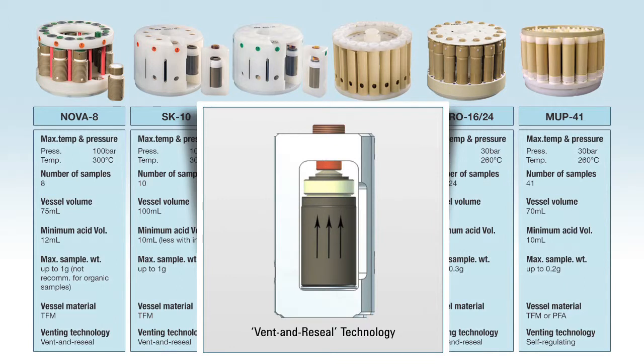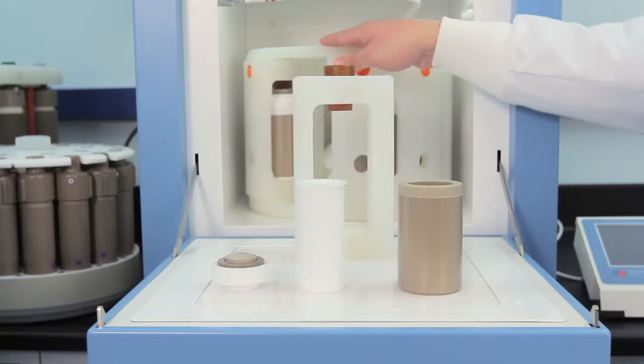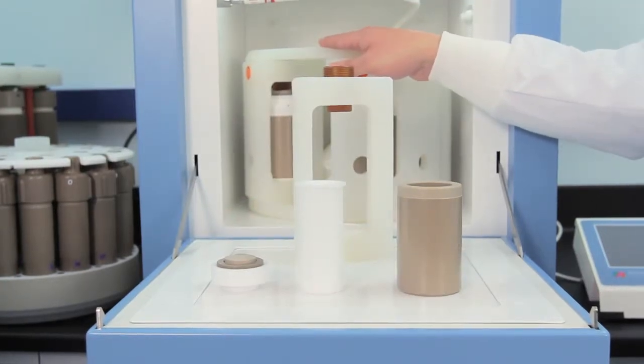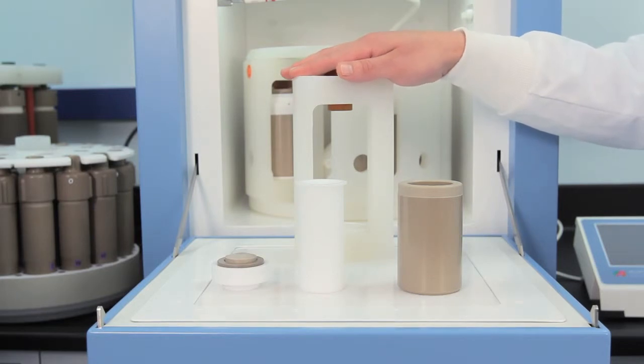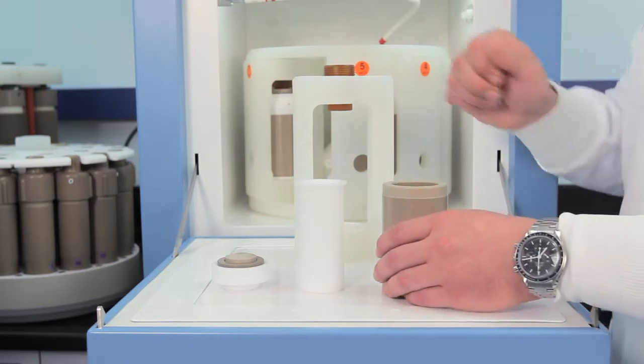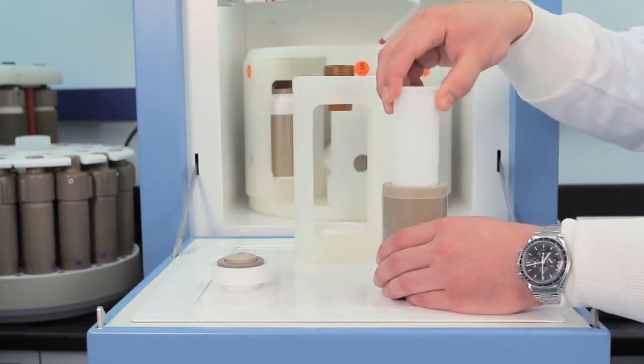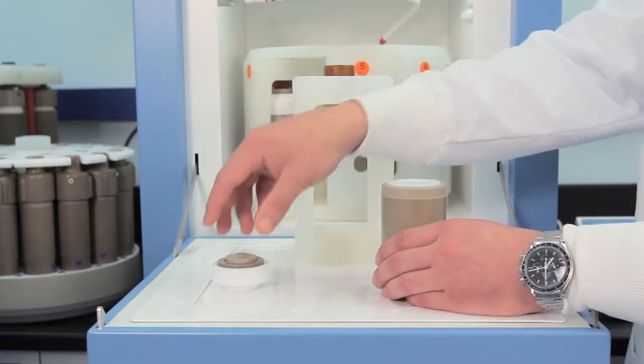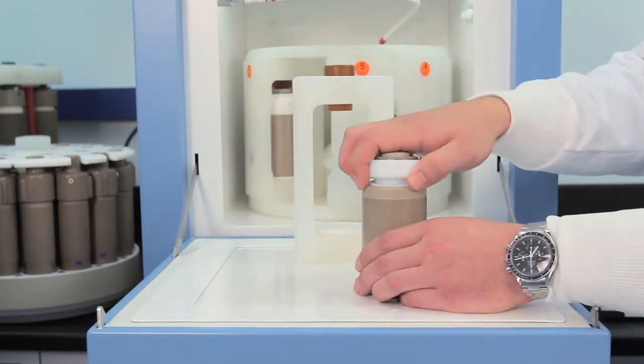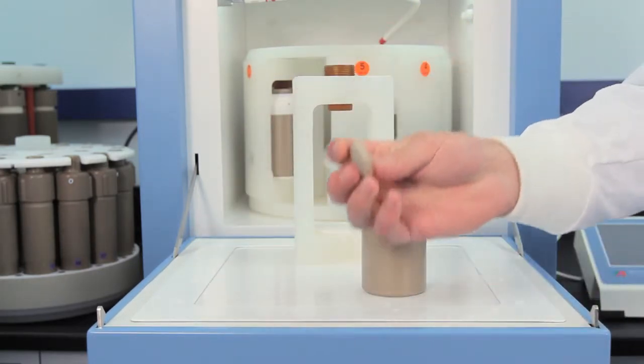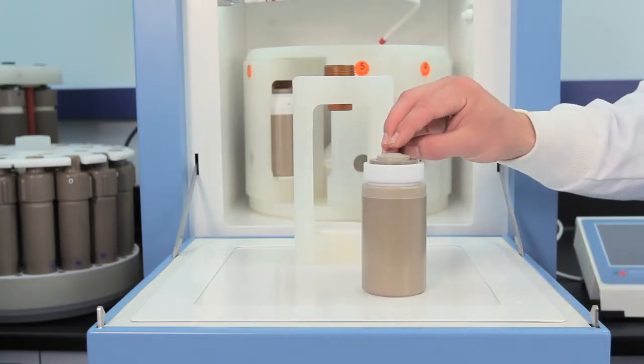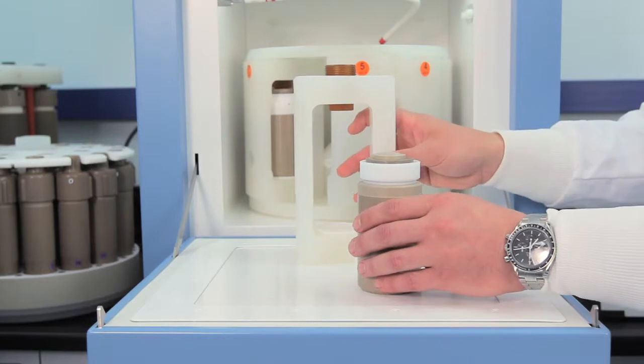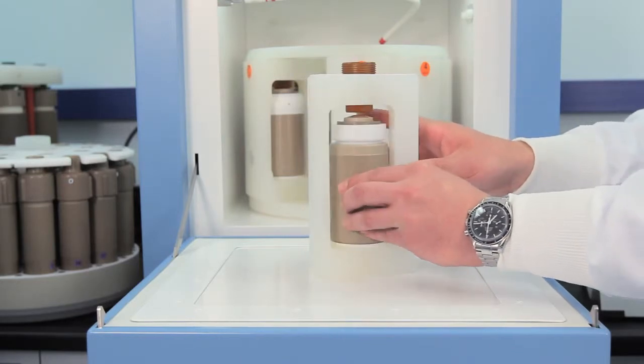This is the SK-10 high pressure rotor with 10 positions. It is a segmented rotor which means vessels can be loaded into the microwave individually if preferred. The vessel is capable of 100 bar of pressure and features Milestone's vent and reseal technology. Should excess pressure occur, this dome-shaped spring will flex allowing the cap to open slightly and gently release excess pressure. The cap then reseals and the run continues without loss of sample.